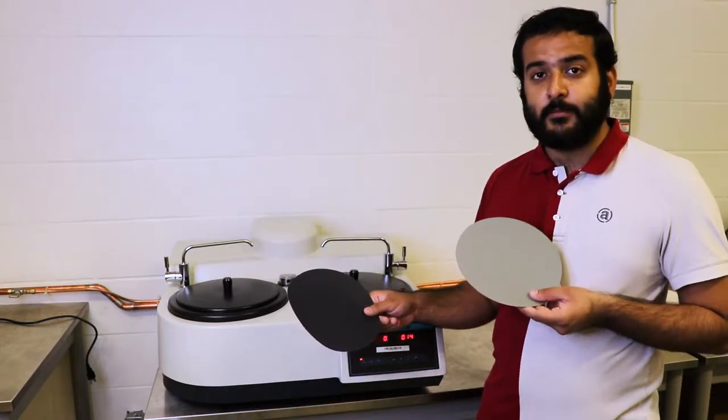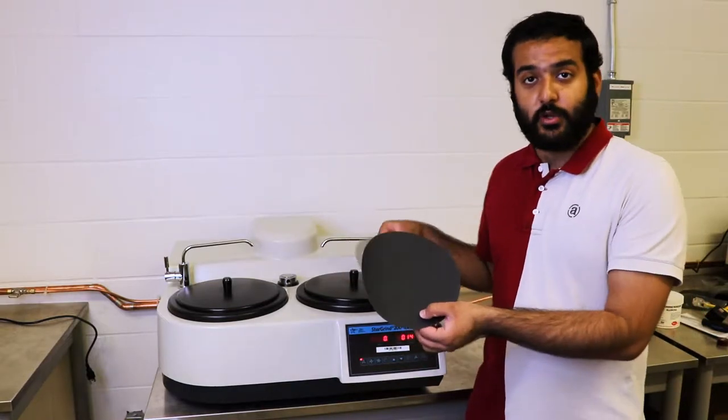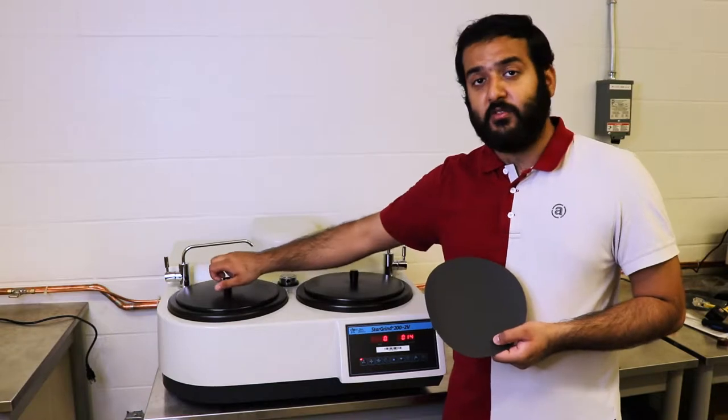We're going to show you how to mount it. It's quite simple. Let's start with 180 grit. You want to start by opening the lid of the machine and putting it to the side.